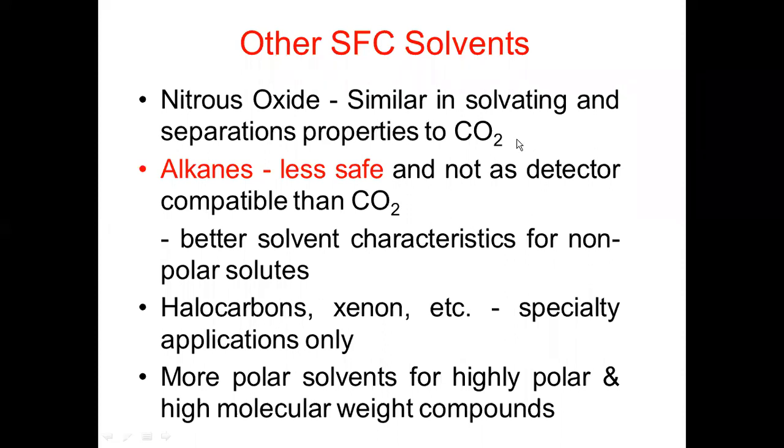It is very similar to carbon dioxide, and even some alkanes can be used. You have to be very careful while using alkanes because they will catch fire. Therefore, they are less safe. And one more problem is they are not as selective as carbon dioxide when compared in terms of detector compatibility.